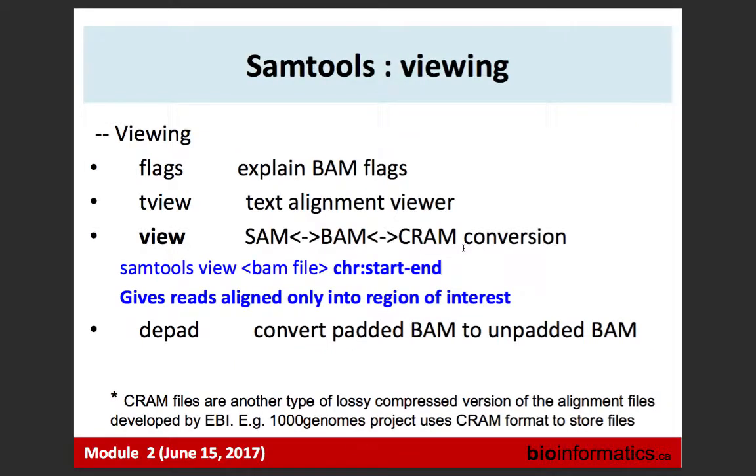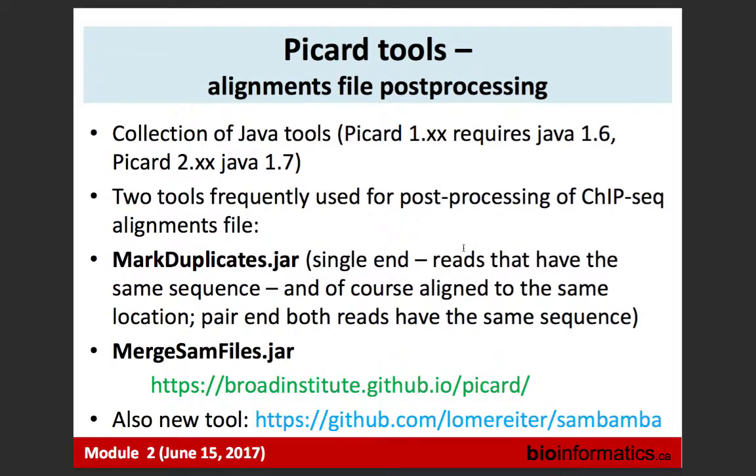Now, there is a brother or cousin of the SAM file called the BAM file, which is actually a binary file. This binary file helps us save space without losing any information. So using SAMtools, we can convert an ASCII file into a BAM file. We will do this practically during the tutorial session. After alignment, we also have to mark duplicates as a separate task; the aligner by itself doesn't know. There are multiple tools to do this. We will be using Picard.